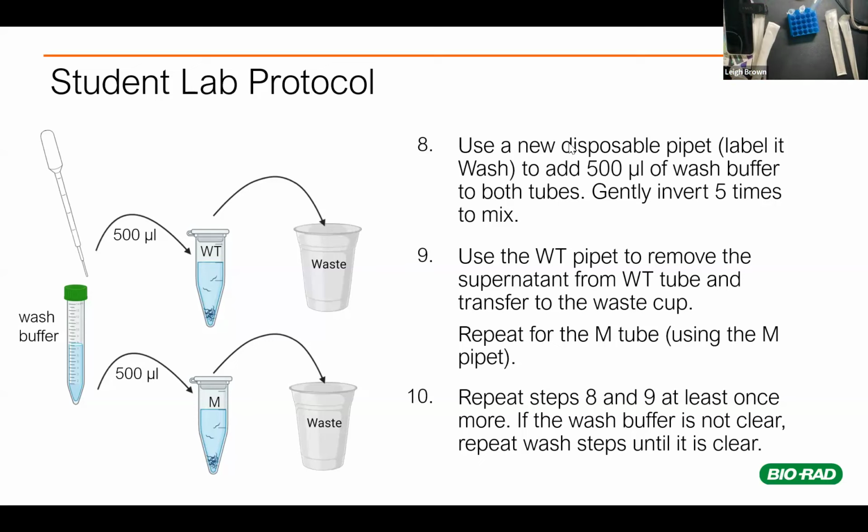I'll also mention, because I'm noticing it on mine, that I have a lot more mutants than wild types. That was true when I looked at my plates too. I don't know if you guys can see the difference in the size of the pellets. That's okay. We're actually going to do a little ratio of worms, so we're not comparing one type to the other in terms of number. So don't worry if there are more worms on one plate. I'll let Damon talk about crowding later on though.